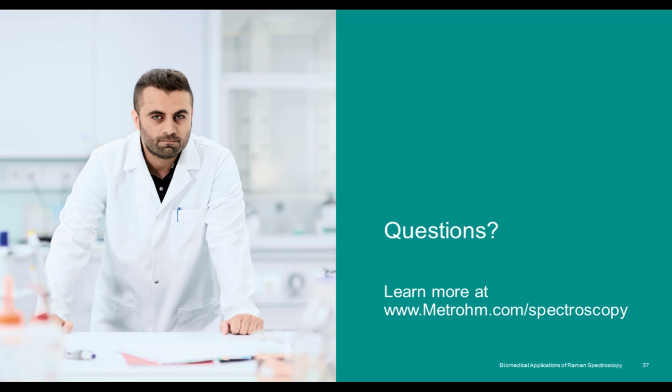Perfect. Thank you so much, both Kristen and Adam, for that answer. So it looks like we've got time for about one more question. Now, can you use a laser-directed beam to reflect off of skin and measure the Raman effect? Yes. So this measurement is definitely possible to detect, especially certain types of tissue.